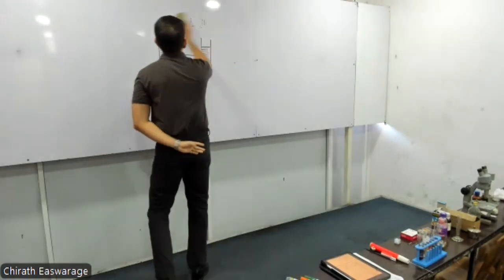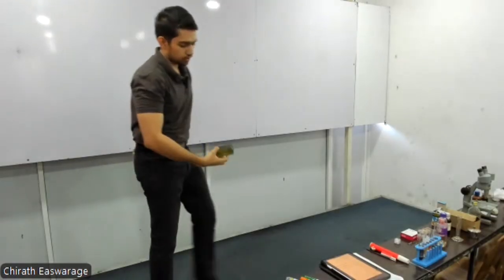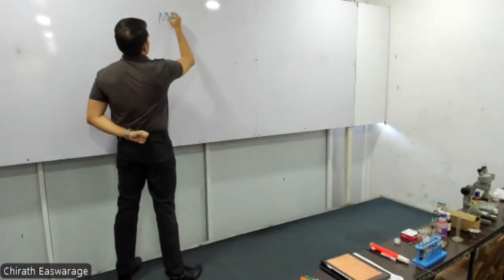microscopes, we can divide them by the type of wavelength, the type of wave that they are using. Based on that, we can classify microscopes as what?